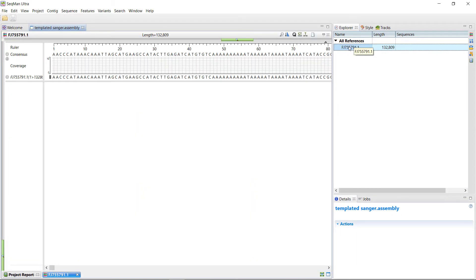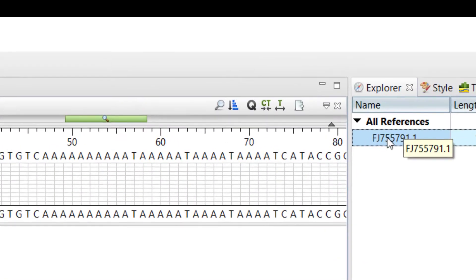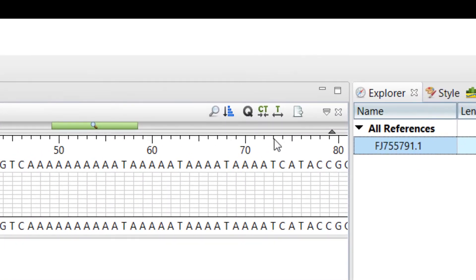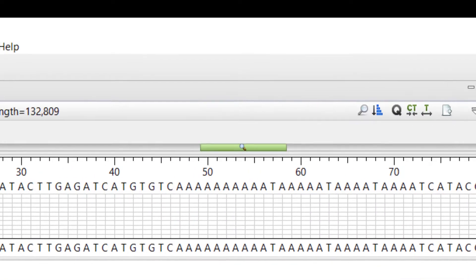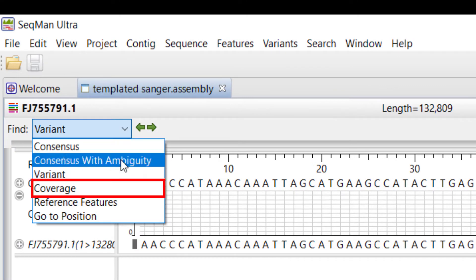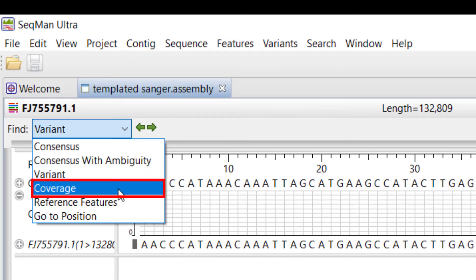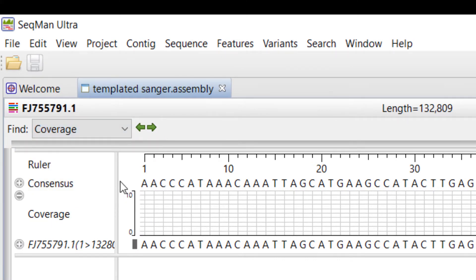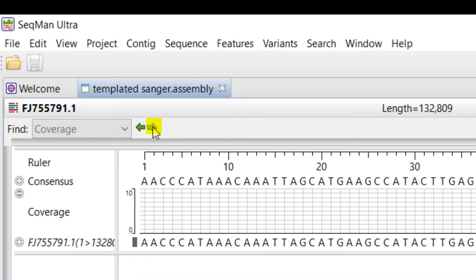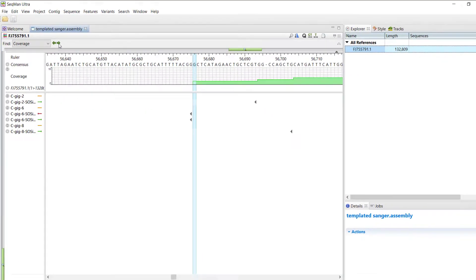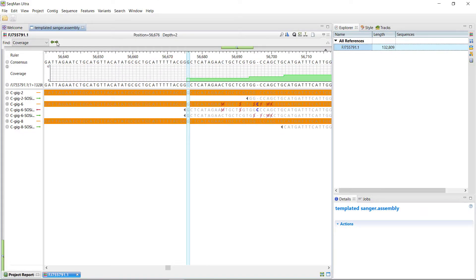Since I don't have sequencing coverage along the entire reference, I'm going to use the Search Alignment tool. Select Coverage under the Find menu. Then, click the right green arrow to move to the region with coverage.